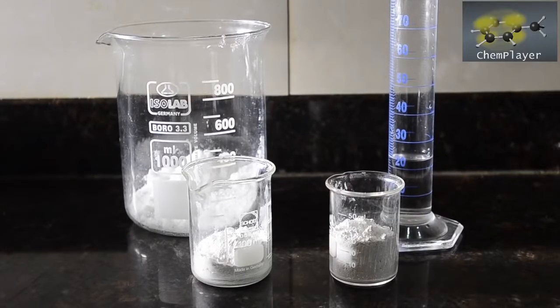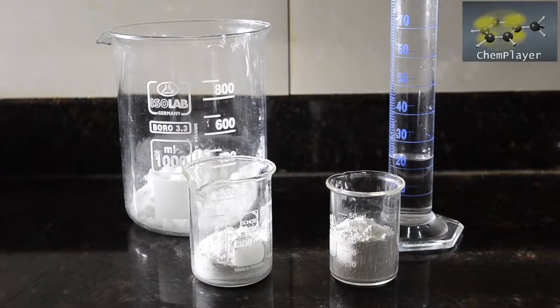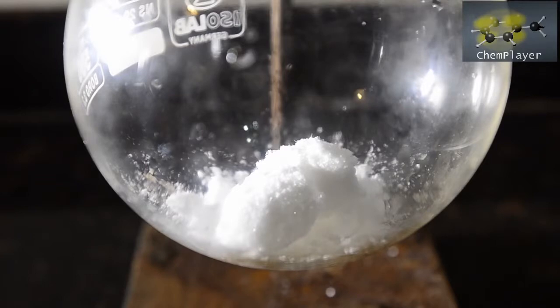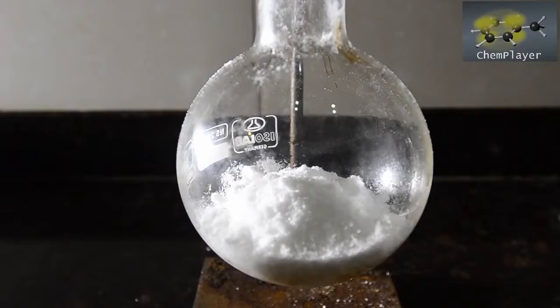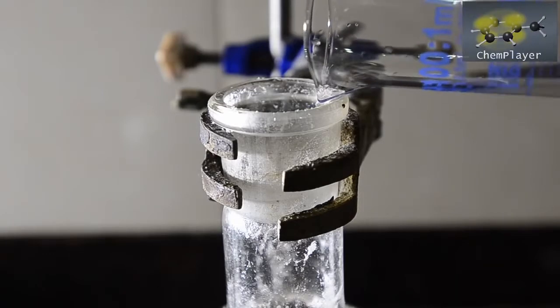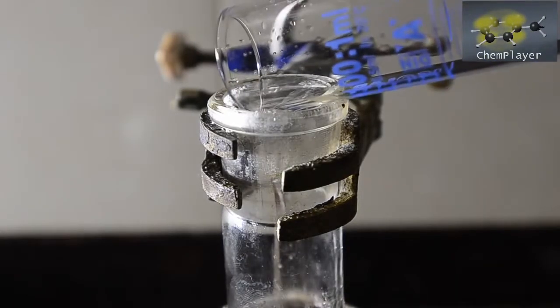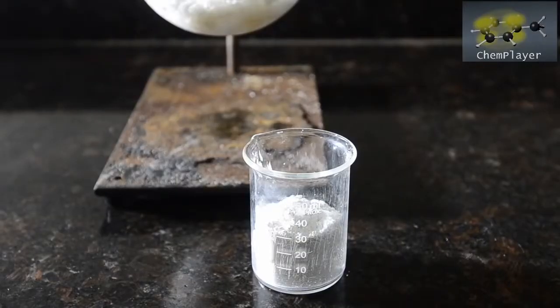As before, here's all our starting materials. We're going to do exactly what we did before, mixing the acids in the 500 ml flask, and then stirring in the calcium hydroxide to neutralize. That's both our acids in. Now for the calcium hydroxide.